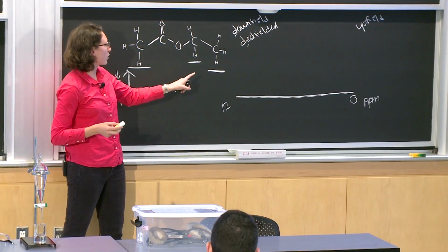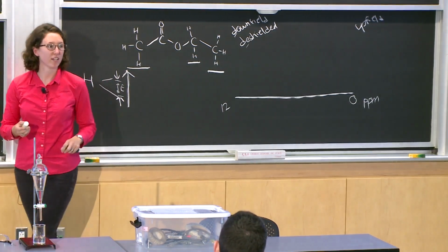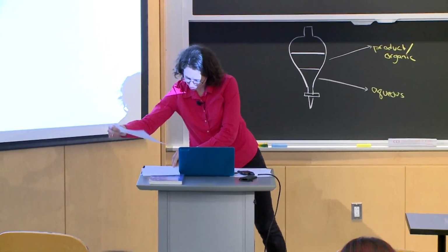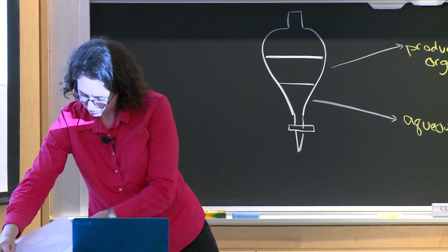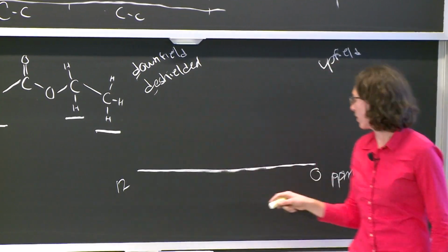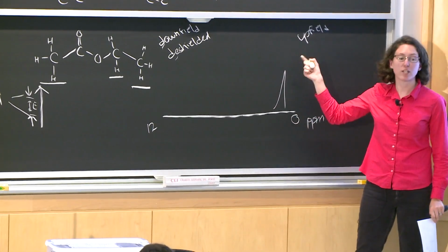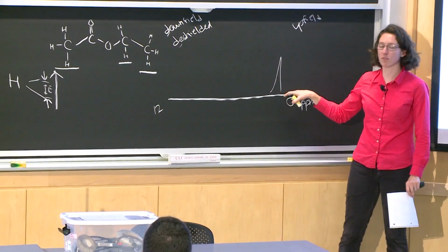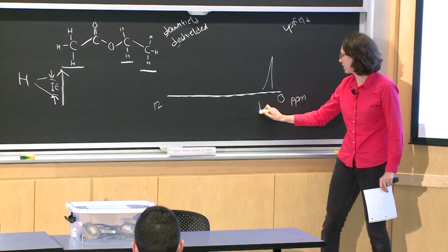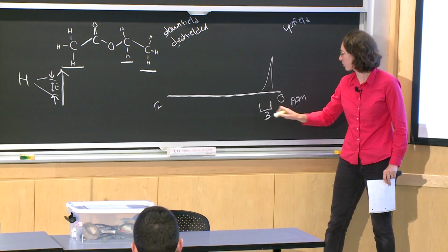And so if we look at these protons, which of these do we think is going to be the most upfield or the furthest away from all of our oxygens? Stuff all the way on the right? Yeah. So, yes. These methyl protons will be the furthest to the right, and you'll get a signal here. And so this signal, the chemical shift value, will be somewhere probably around 1 or 2. And then the integration tells you how many protons it's for, and that shows up down here at the bottom. So how many protons will this signal equal? 3 from our methyl group.